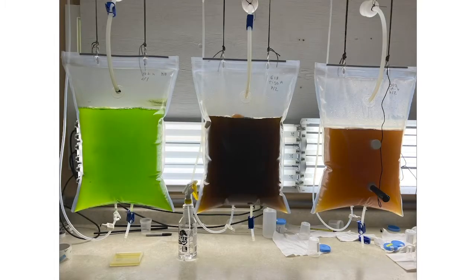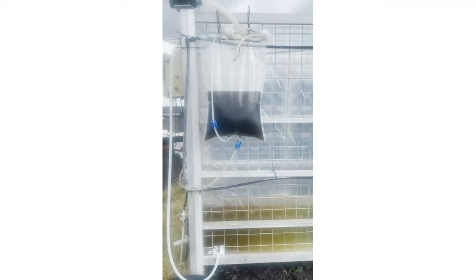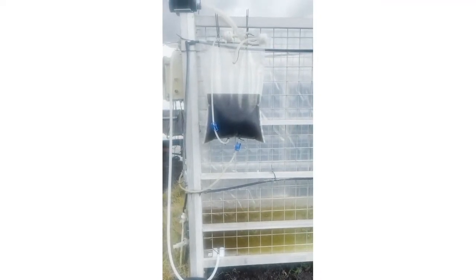The 25-liter bags with five ports have two extra ports for pH and temperature probes. The five-port bags are used with our remote Wi-Fi control system, which can provide pH control, temperature monitoring, and LED light control for two 25-liter bags. This pH control box is sold separately. Once the 25-liter bag cultures reach peak density, they can be used to inoculate our 250-liter systems.